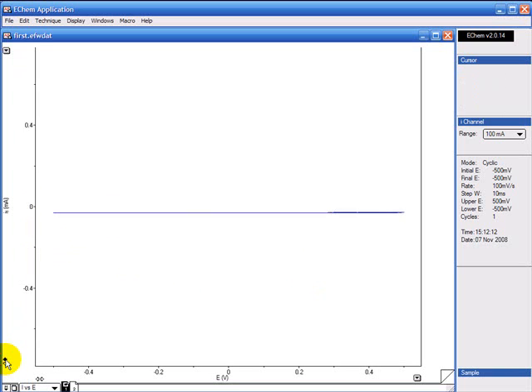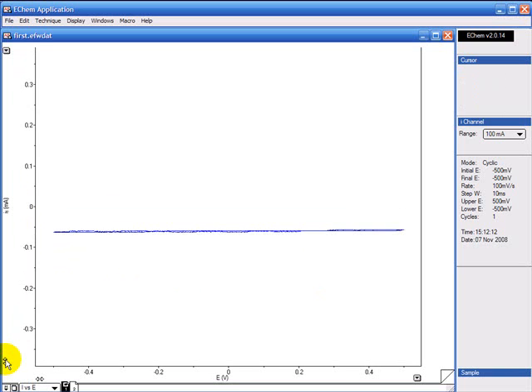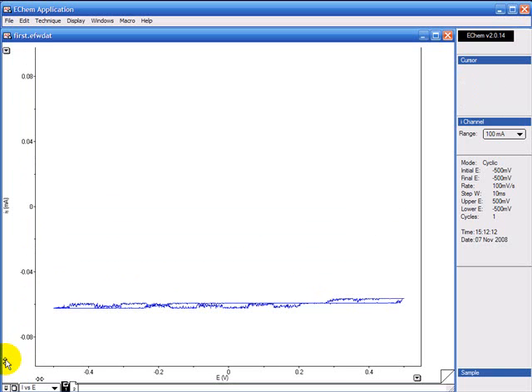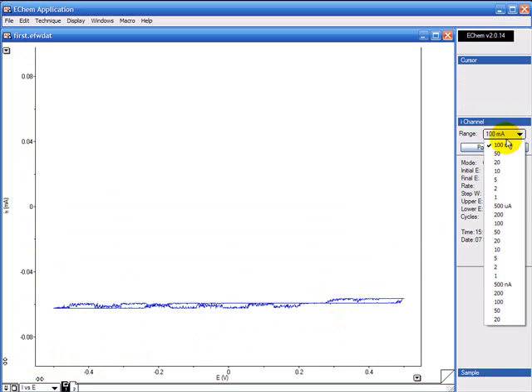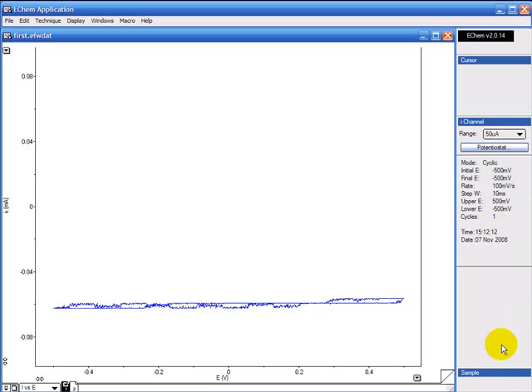Now you can see that the range I've chosen, the 100 milliamps, there's not a lot of shape to this cyclic voltammogram. I need to change the range. I'm going to lower it to say 50 microamps and I'm going to run again.